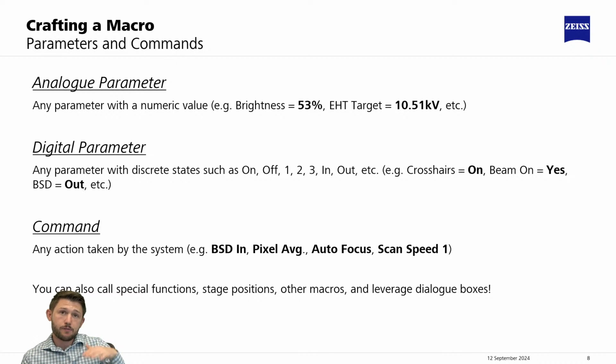I'm going to take one level deeper of detail for those who are curious. When it comes to the automation, and many of the examples that I just mentioned, we're utilizing macros. As I mentioned on the first slide, macros do not demand any programming understanding or expertise. You don't have to know a language. The syntax is as simple as picking options from lists.